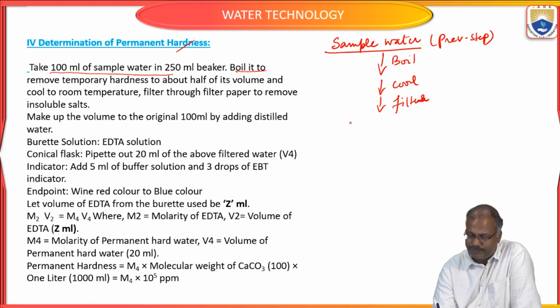We get water removed of carbonate hardness.